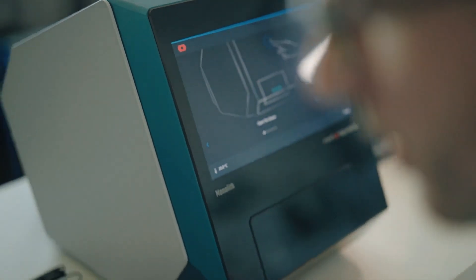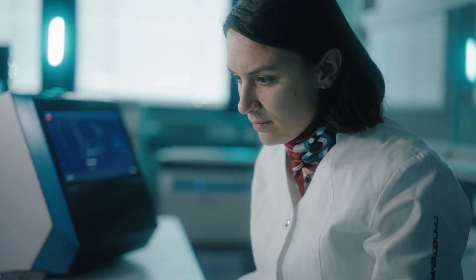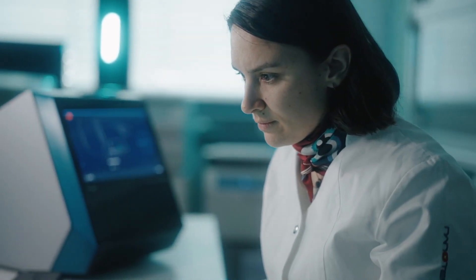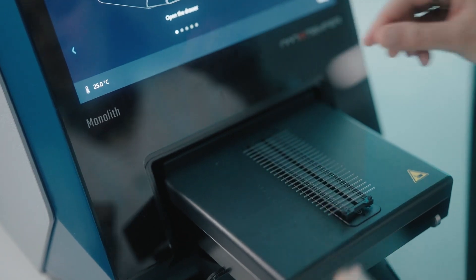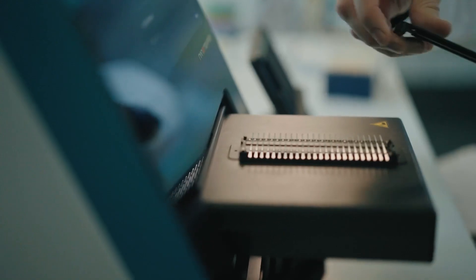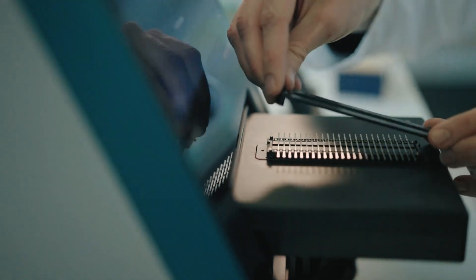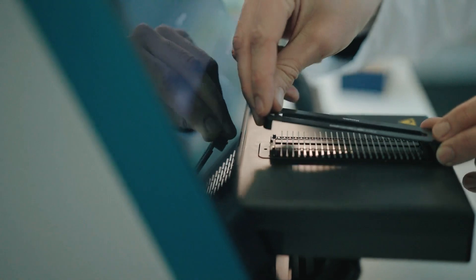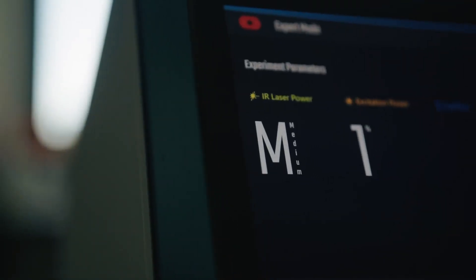It performs in-solution measurements under equilibrium conditions, and on top of it, Monolith X doesn't consume a lot of your sample. The Monolith X incorporates the already popular MST technology with Spectral Shift, the latest technology for looking at molecular interactions.